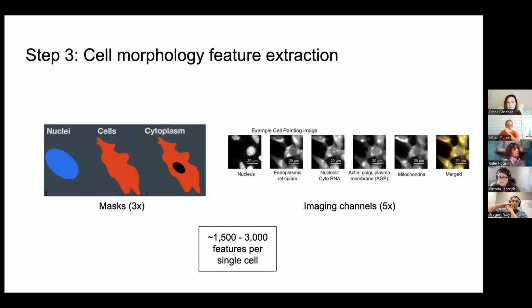There are going to be some organelles that are in the Z plane. So we do measure some mitochondria that look like they're in the nucleus, but because the cells aren't 2D, they're 3D, some of the mitochondria could be on top. But performing that subtraction really allows us to focus on the ER and the mito and the Golgi that we expect to be outside the nucleus. Okay, that's a great question. Thank you.